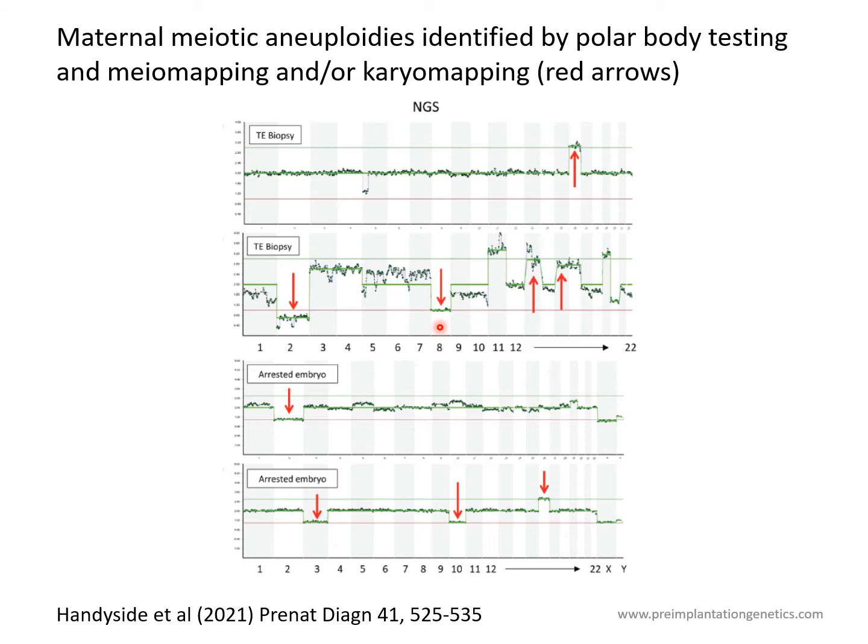There was no SNP evidence showing a pattern of crossovers that a minority of cells in the biopsy had the potentially missing chromosome. So we assume that these losses are meiotic. But as you can see, particularly in this sample, there are other quite clearly full chromosome gains for other chromosomes which showed no evidence of meiotic trisomy and are presumed to be of mitotic origin.